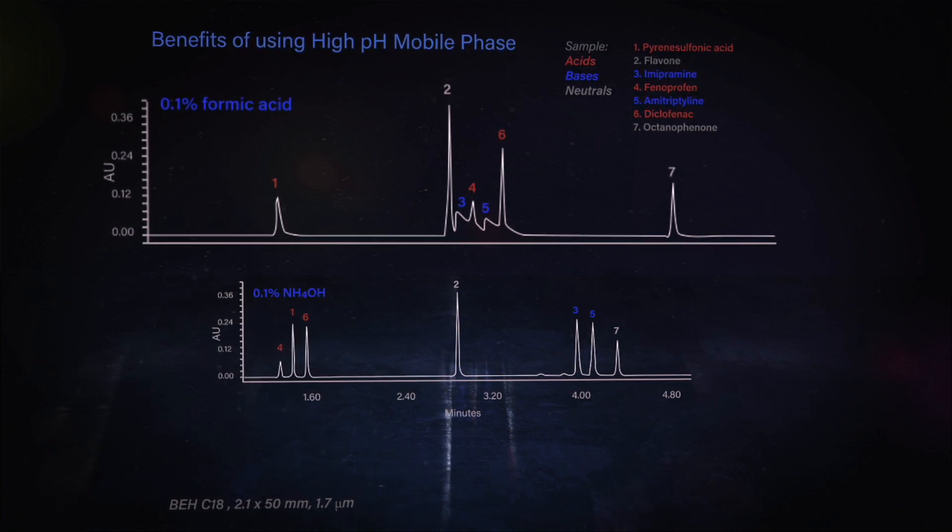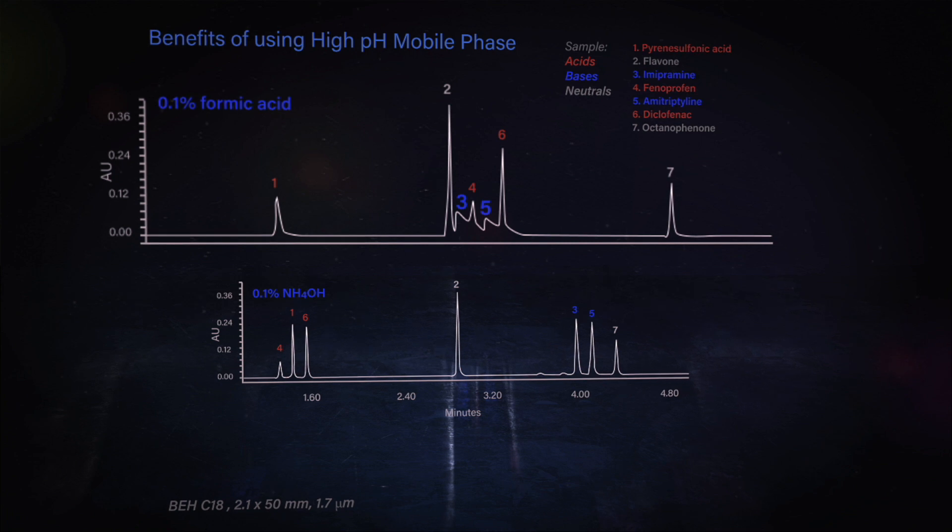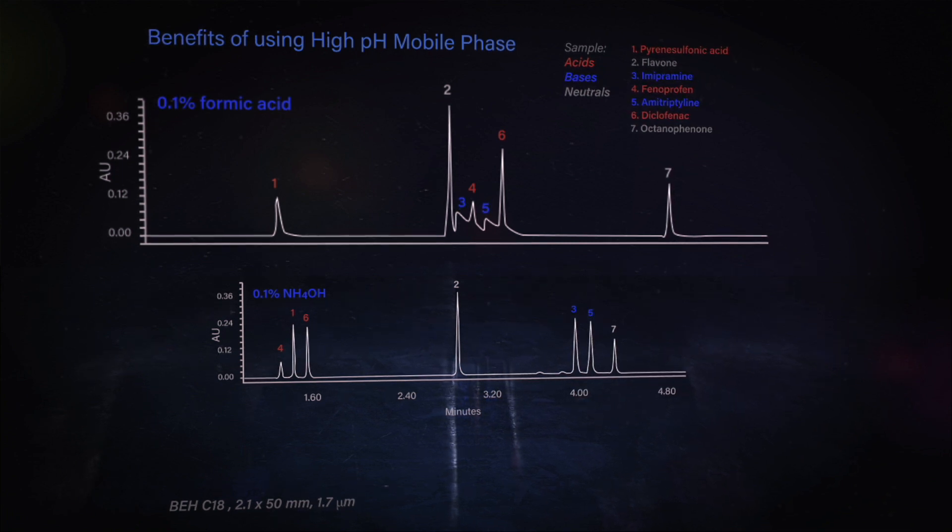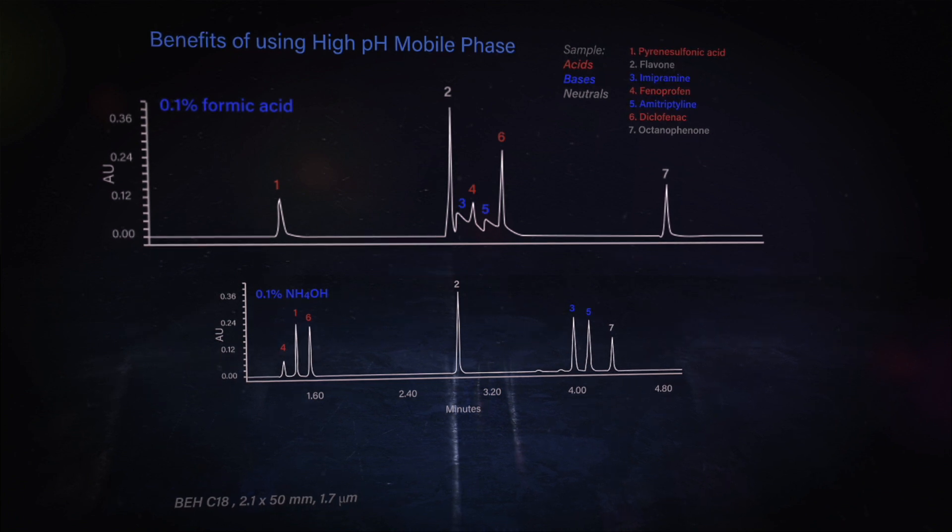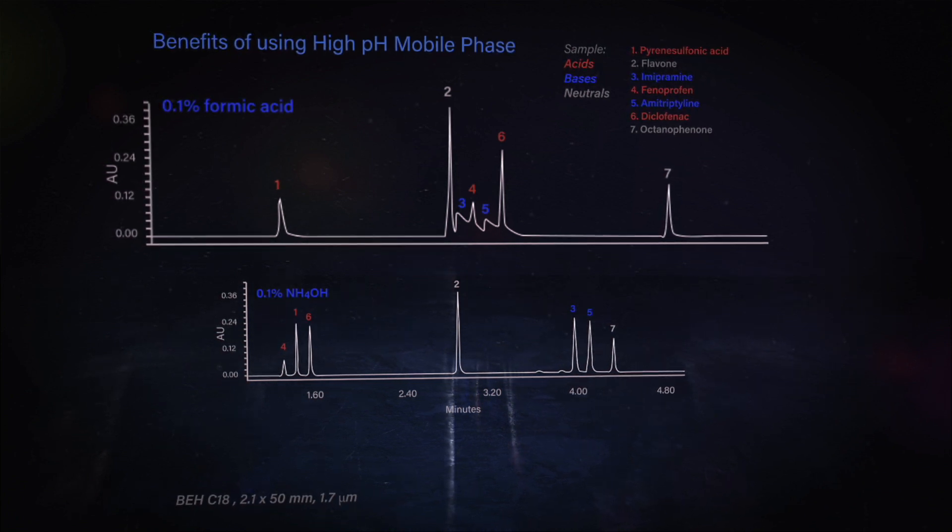But you can see the basic analytes, peaks three and five, they have pretty poor peak shape, even though they are kind of well retained. Yeah, they have kind of that shark fin peak shape, and they're really going to interfere with the quantification of peaks four and six.